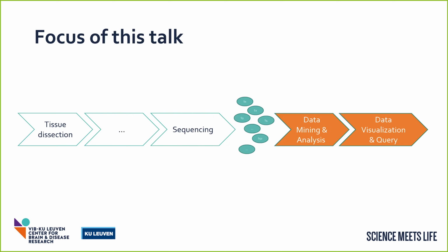So with that, I'm going to start into the talk. You're going to see quite a lot of overlap here with Hongji's talk, but that's actually quite good for the demos I'm going to show. The focus of this talk is really the data mining and analysis, and the data visualization and query of the FCA data. It's a huge amount of data, and how are you going to be able to leverage that and look at it in your own analyses?